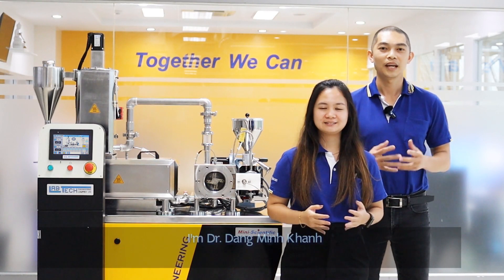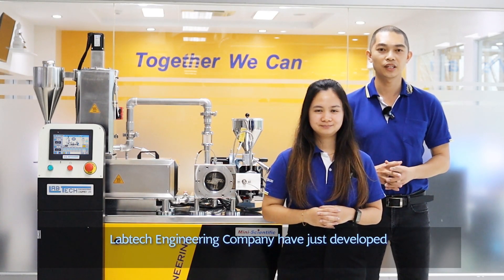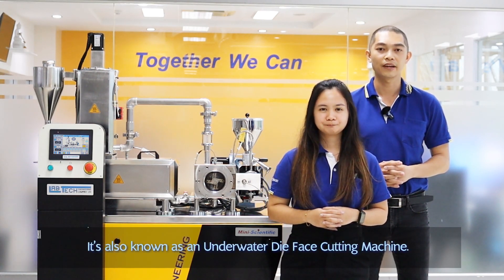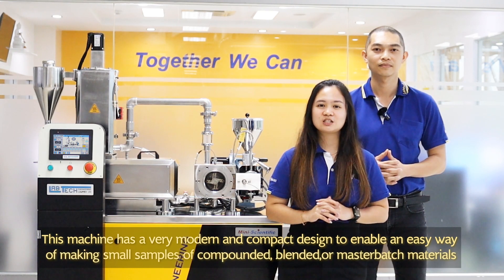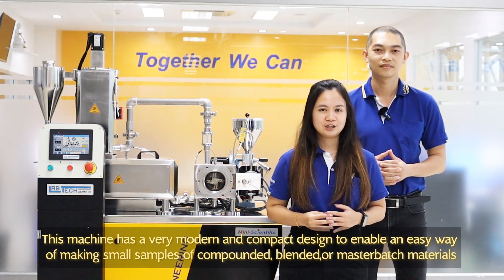Welcome to Lab Tech Engineering. I'm Dr. Dang Moon Kang, and I'm Junie. Lab Tech Engineering Company has just developed a new mini underwater pelletizing machine, also known as an underwater die-face cutting machine. This machine has a very modern and compact design to enable an easy way of making small samples of compounded, blended, and masterbatch materials.